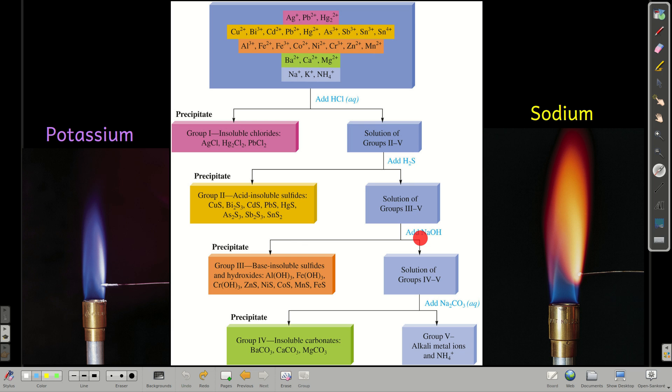Next, we just add some sodium hydroxide, and that will precipitate out as sulfides, the ones that are base insoluble, as well as any hydroxides that are in there, any insoluble hydroxides like aluminum hydroxide, iron 3 hydroxide, chromium 3 hydroxide. And so we get group 3, these guys right here.